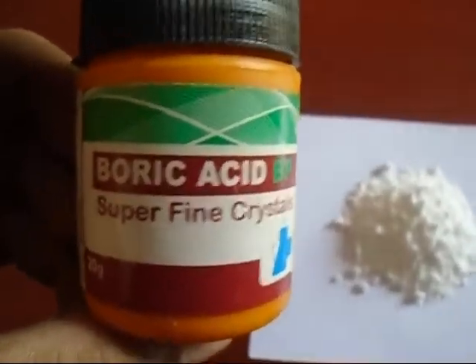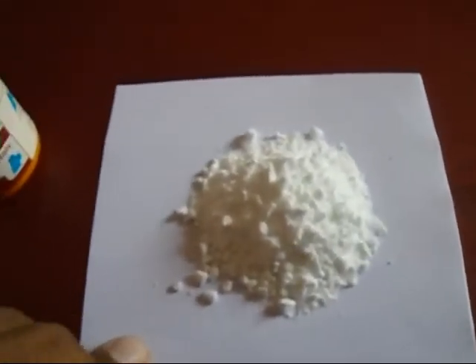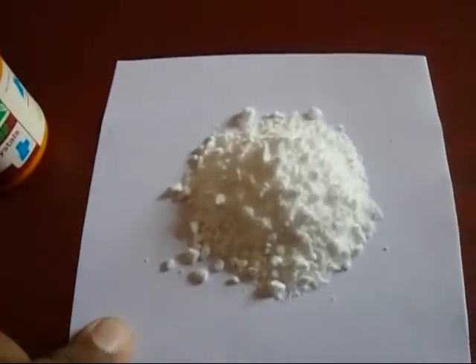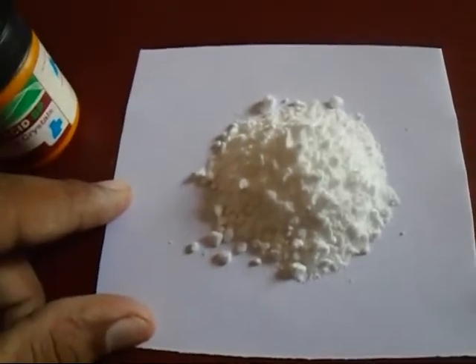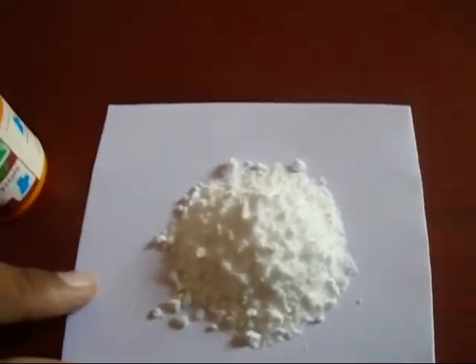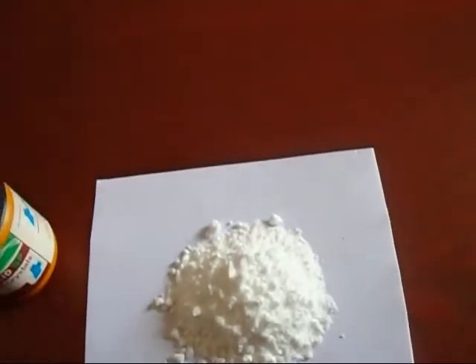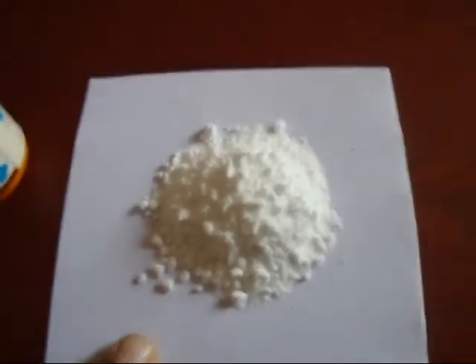You can see I have boric acid here — super fine crystals. I showed how to make boric acid from borax in my previous videos. In this video, we are going to make elemental boron, and we can start this from boric acid.